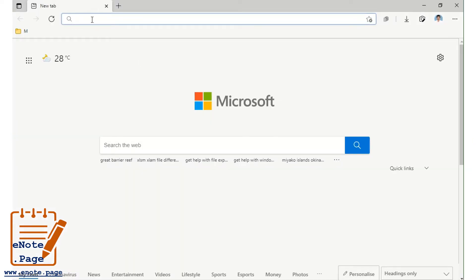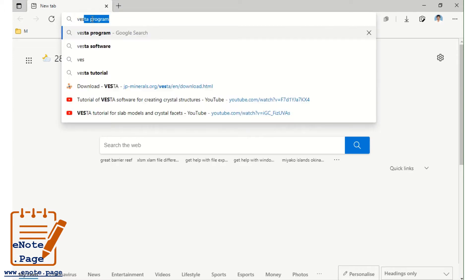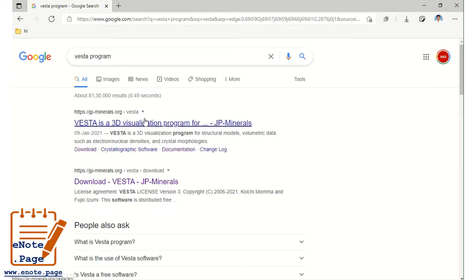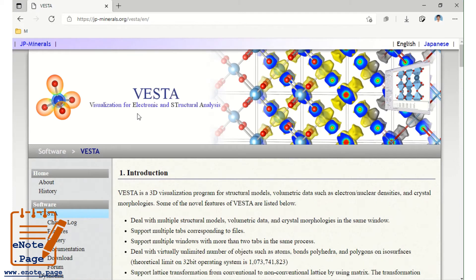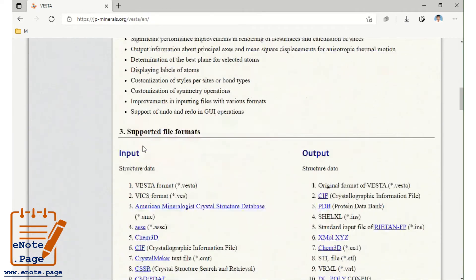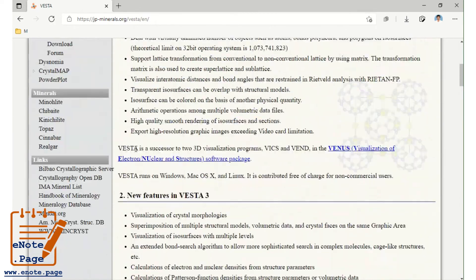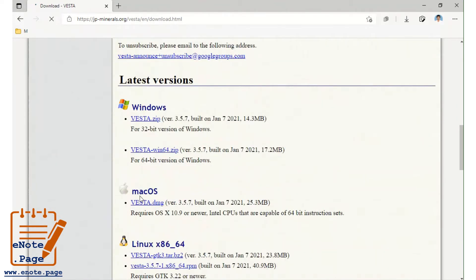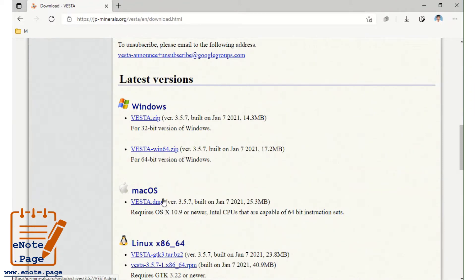Just type 'VESTA program' in Google. This is the site — VESTA, Visualization for Electronic and Structural Analysis. The site is JPMinerals.org. From the bottom, you can download it. Go to the download section and choose your operating system, then download.